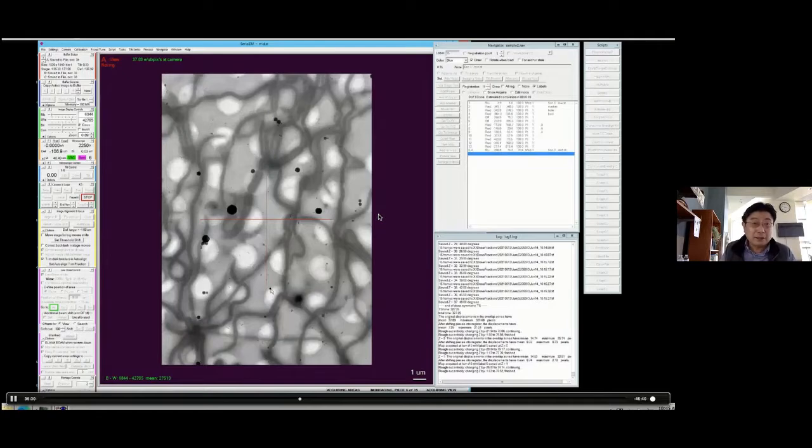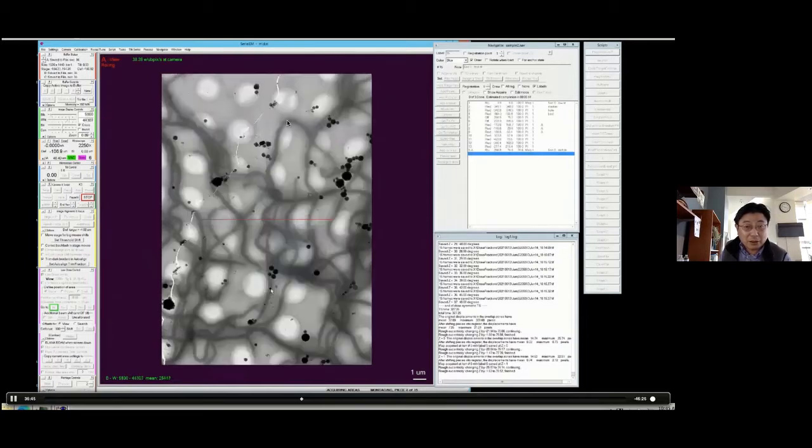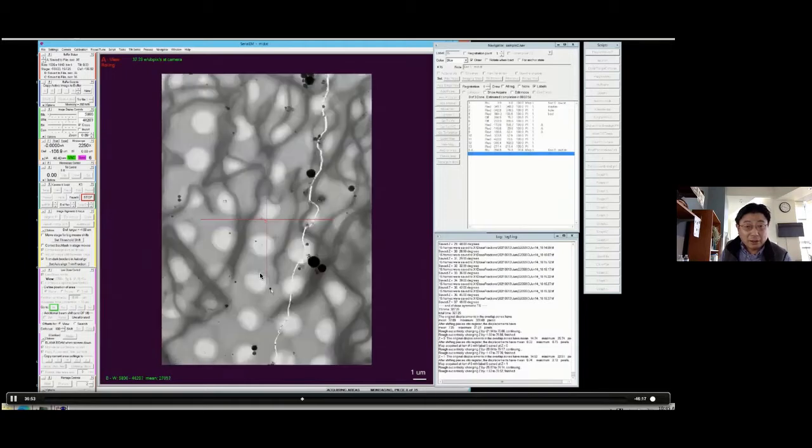So basically it means you need to find 120 targets. And then obviously for other samples, this may be a piece of cake. And this one is slightly difficult because our interest is only in certain regions of the cell, not everywhere, and the cell is very long, elongated. So I will show you how, but it doesn't matter how you select it.